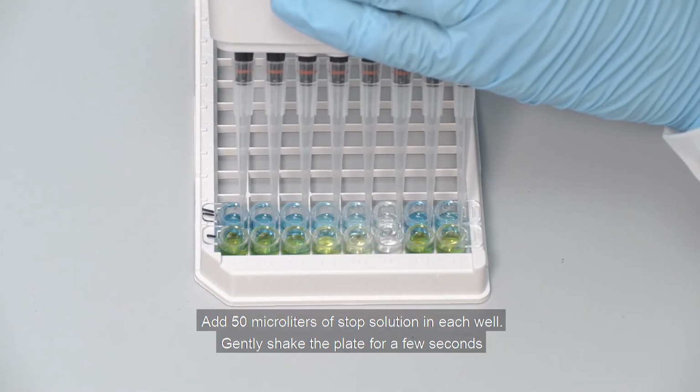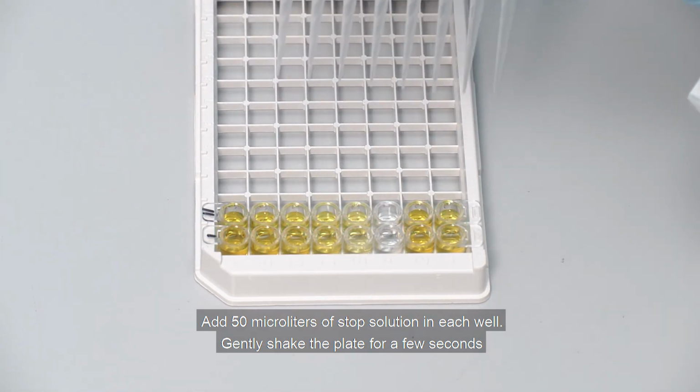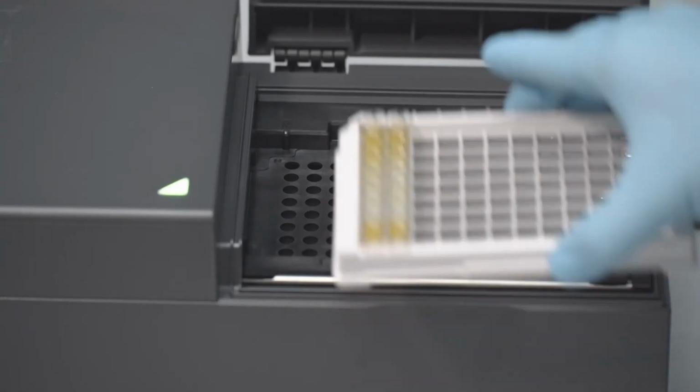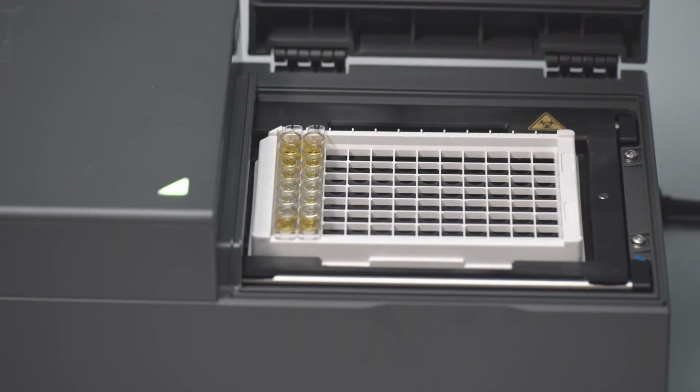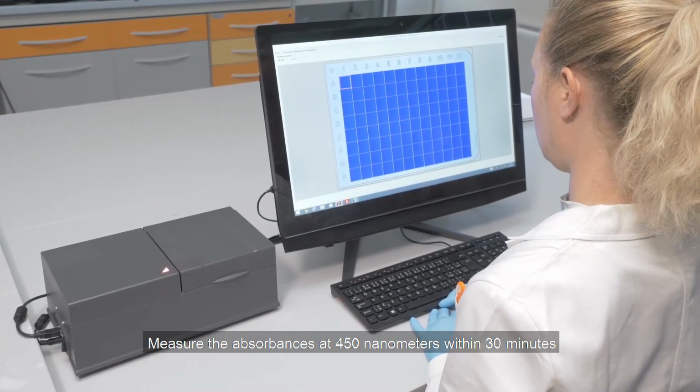Add 50 microliters of stop solution in each well. Gently shake the plate for a few seconds. Measure the absorbances at 450 nanometers within 30 minutes.